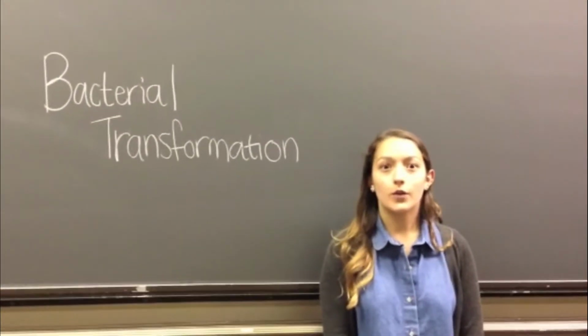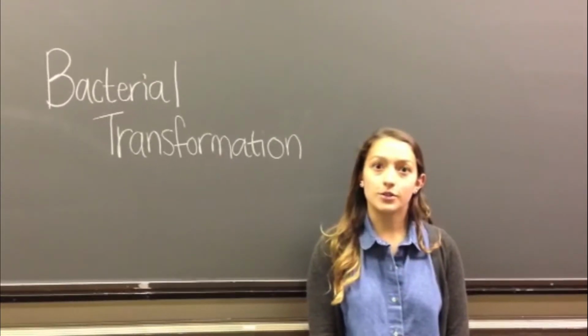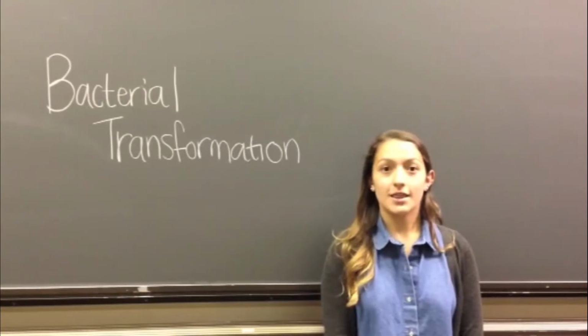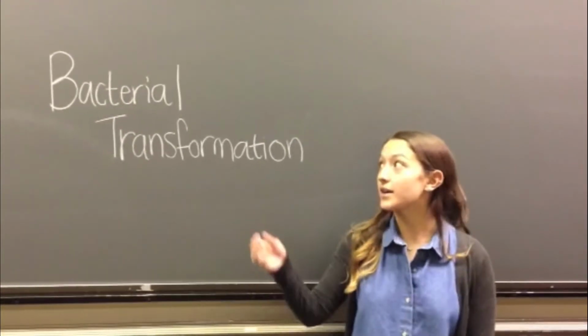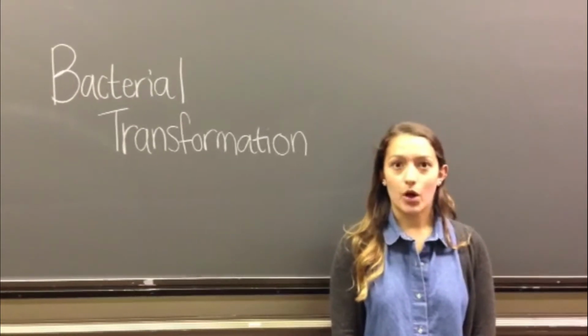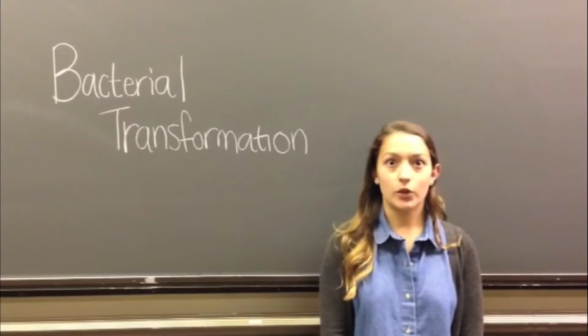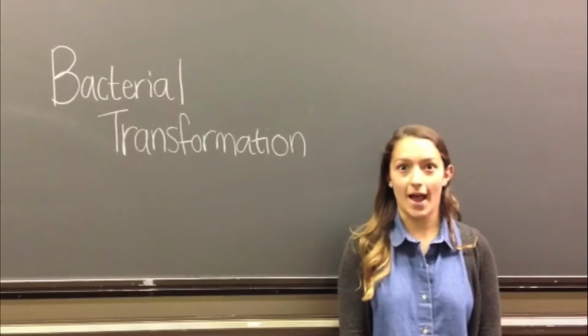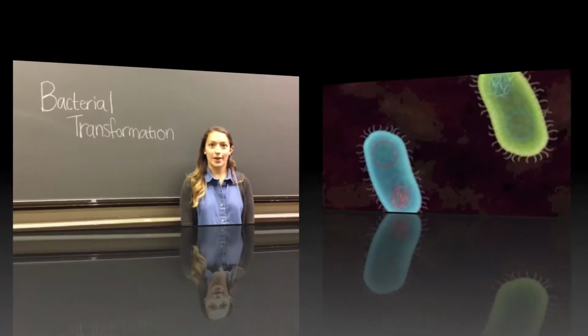If you're following our video tutorials, you should have just watched a video on plasmids, also known as vectors. In this video, we will be discussing bacterial transformation. We will be showing an actual protocol, as well as explaining the molecular biology behind each step of a bacterial transformation lab. We hope you enjoy.